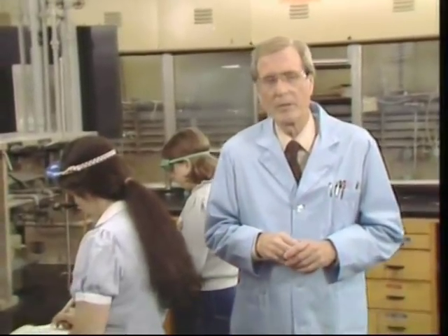I found that very often safety glasses wind up on the top of a student's head. Remember, even though you might not be working with any chemicals right now, people around you are. You're still in a lab. The danger is still present. What if your neighbor has an accident? You'll be unprotected. This is really important.